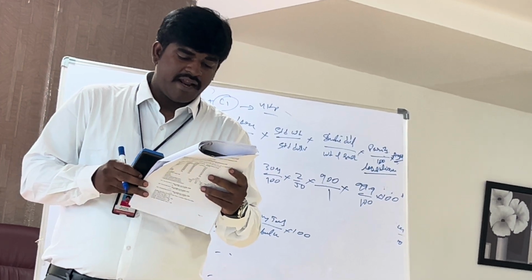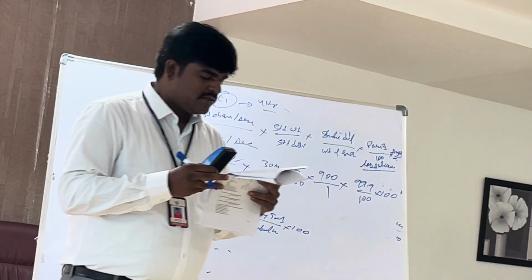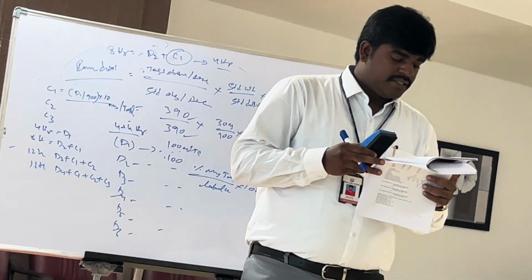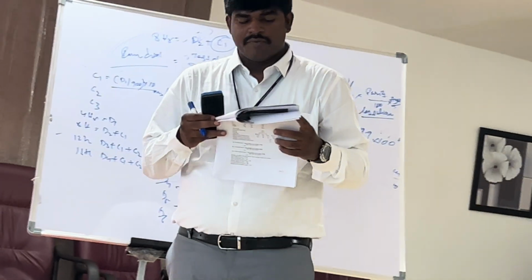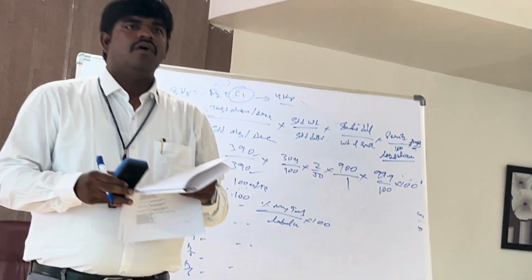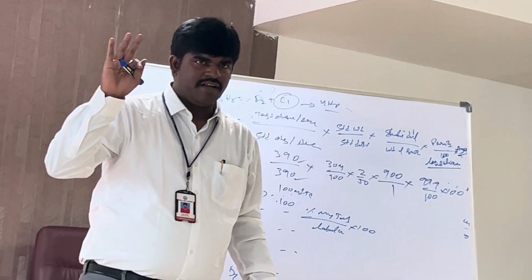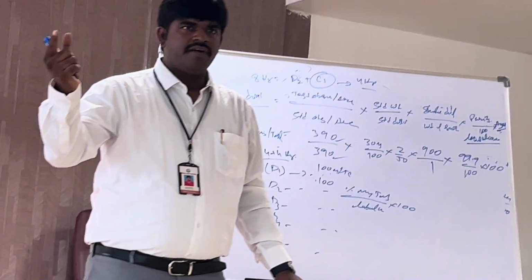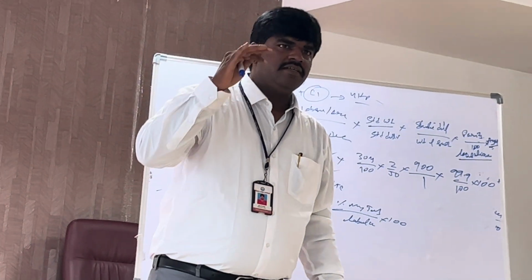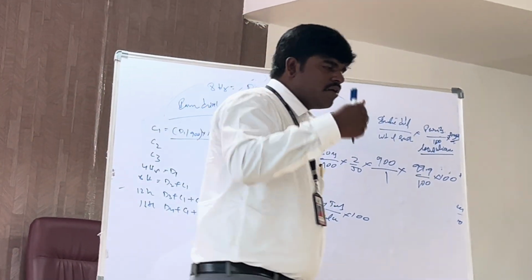Residual solvents are defined as organic volatile impurities that may remain in active pharmaceutical ingredient substances, excipients or medicinal products after processing. Depending upon the safety data and the risk to human health, these solvents are classified as class 1, class 2, class 3. So if you are doing any residual solvent, there are only three classes of solvents available. These three classes will be assessed by using gas chromatography.